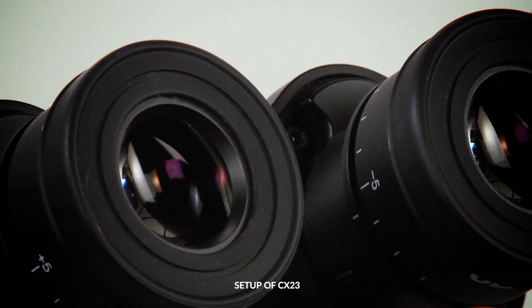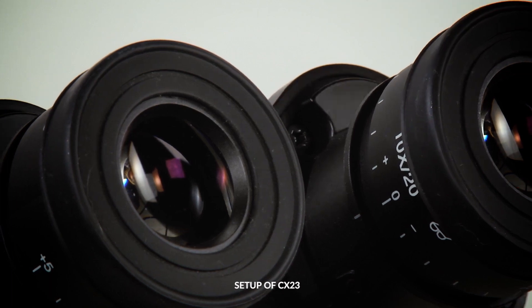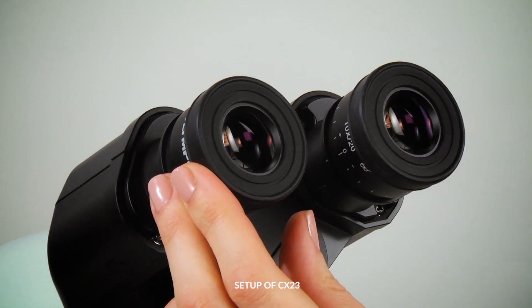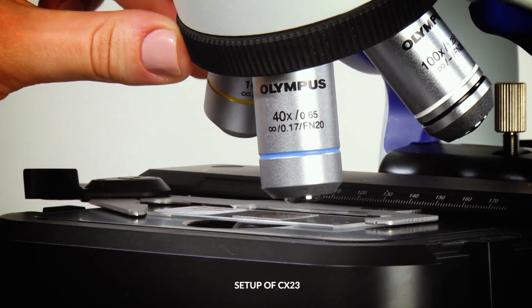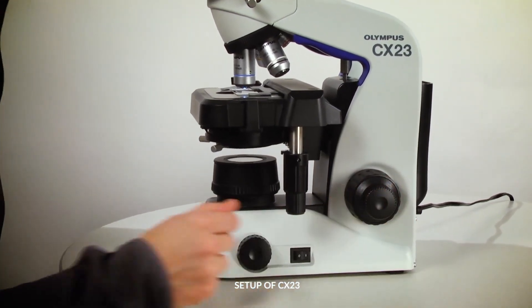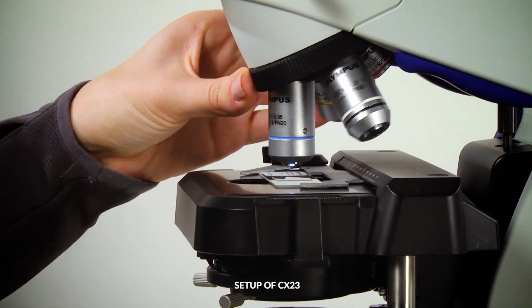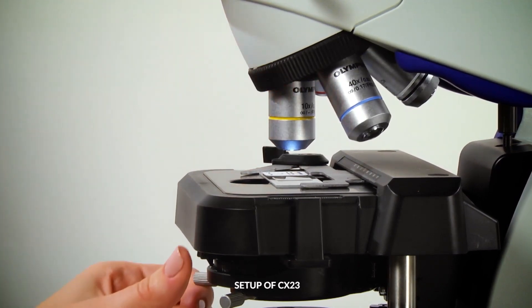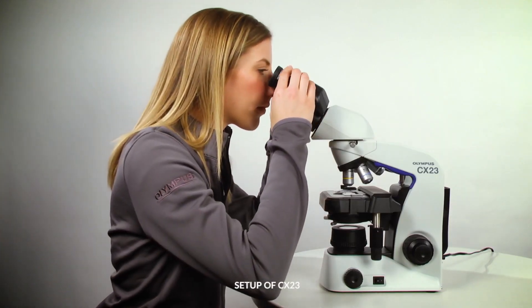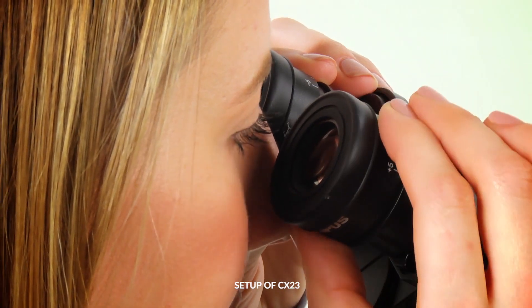To properly adjust the eyepiece's diopters, rotate the diopter adjustment ring on both the right and left eyepieces to the index 0 position. Place the 40X objective into position and adjust the focus using the coarse and fine focus knobs. Once in focus, switch to the 10X objective. Look through the right eyepiece only and adjust the diopter ring so it's in focus. Repeat this step with the left eyepiece.